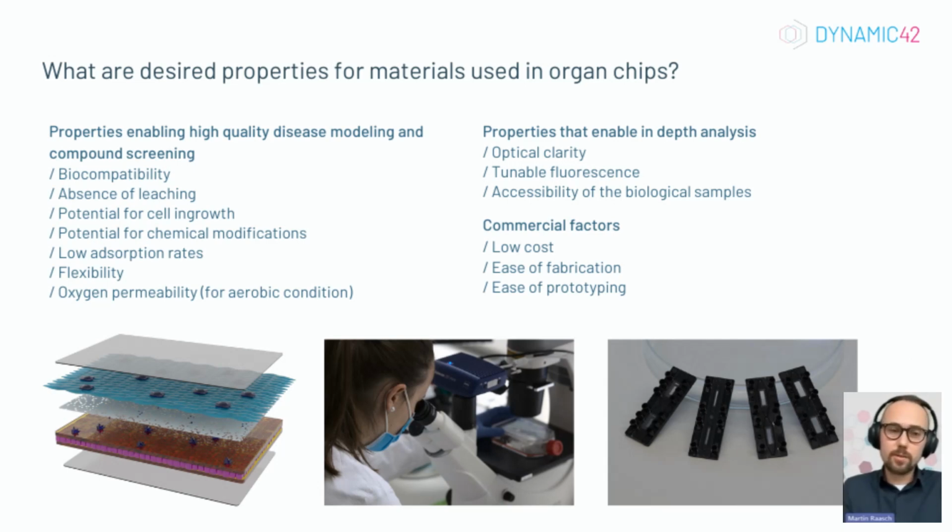And one of the big issues we are also addressing today is, of course, adsorption of compounds. This is a very hot topic when you want to use your model not just to answer biological questions, but really to look into therapeutic options to treat diseases.